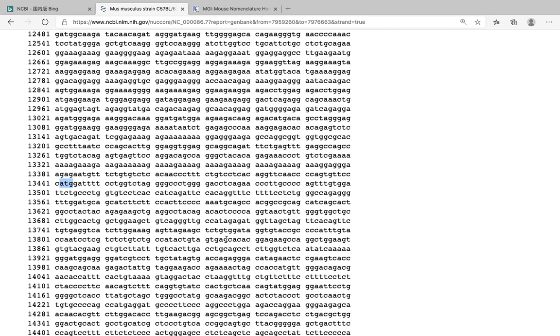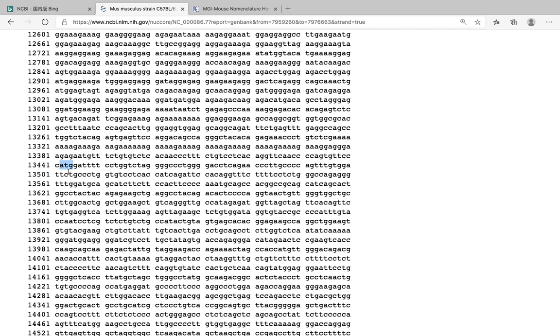Now I want to delete this gene. I need my sgRNA somewhere round about this start codon. I can go upstream also, I can go downstream also, but keep in mind that for deletion of the gene, you might use two sgRNAs, to cut the DNA fragment in two places. So this is more efficient.